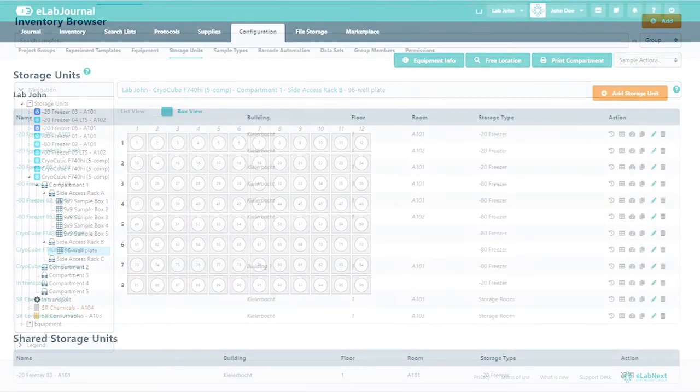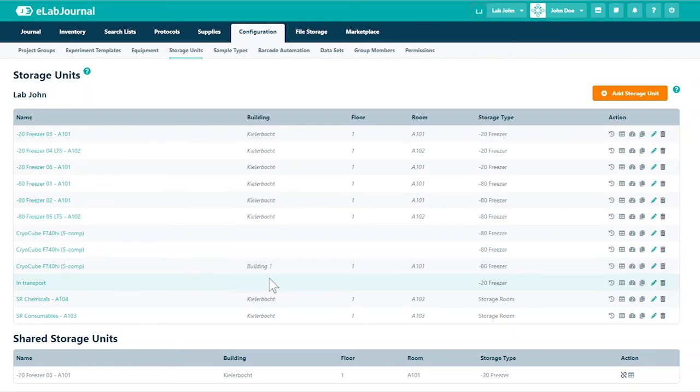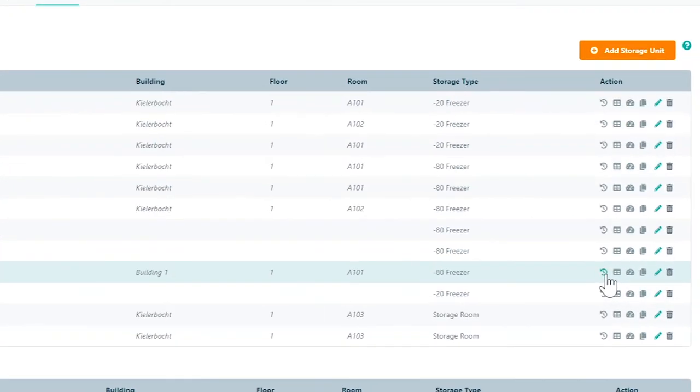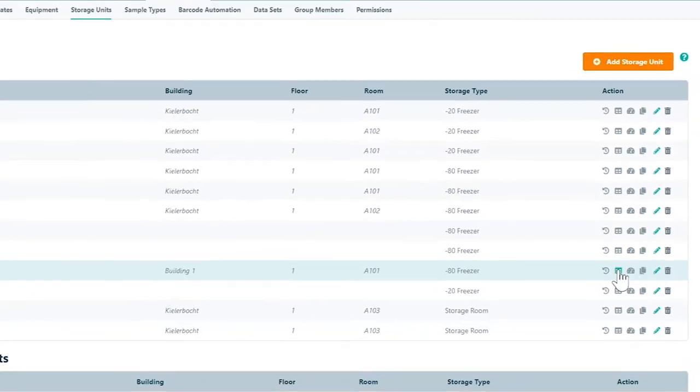If you need to modify the configuration of the storage unit, navigate to storage units in the configuration menu. From here you can create a reservation.